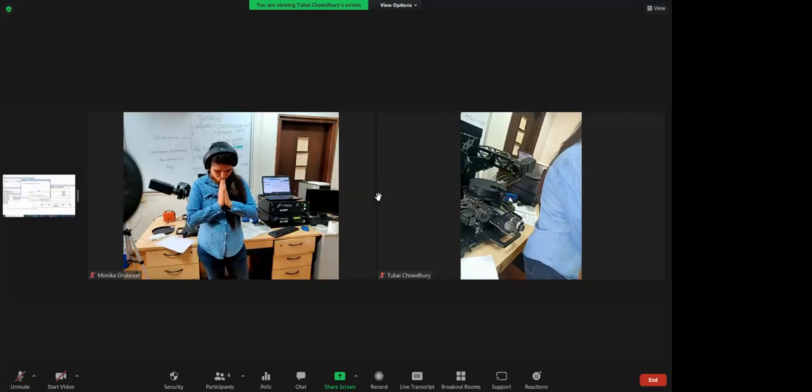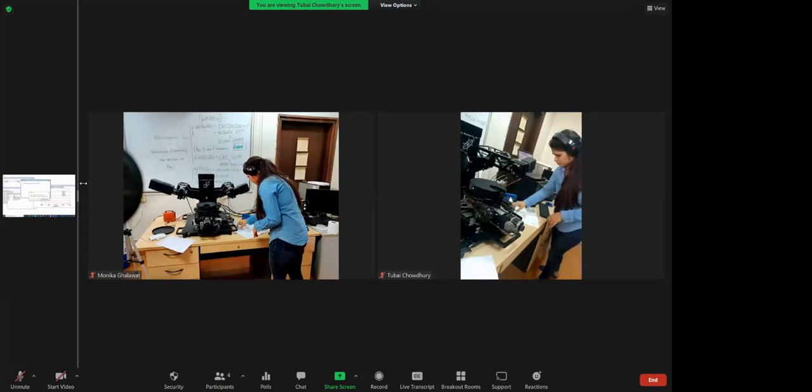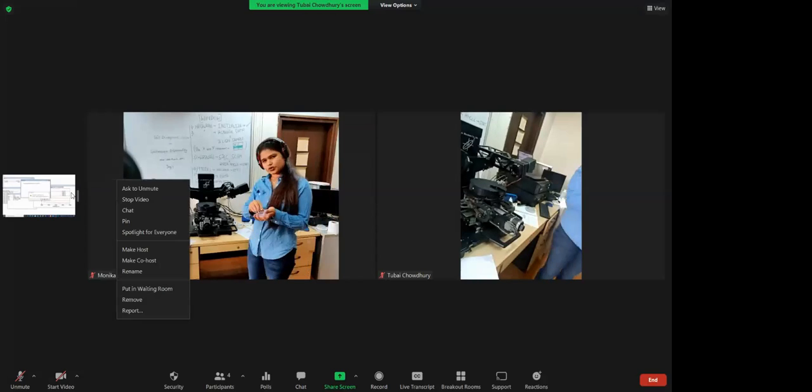As in UV-visible, we take the film and record the absorbance, reflectance, transmittance. I'm asking here for the reflectance also for the film. The method we are using here till now was in reflectance. If you want to go for transmittance mode, you can choose transmission mode, but this sample is not suitable, give me one second. We are using reflectance mode only.